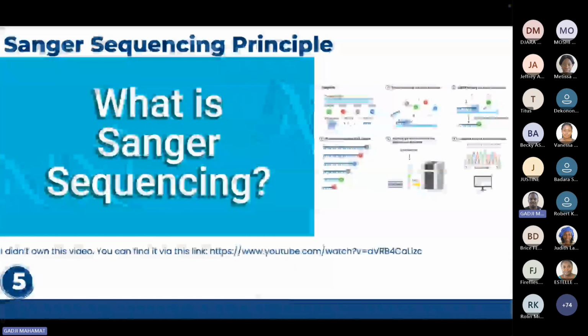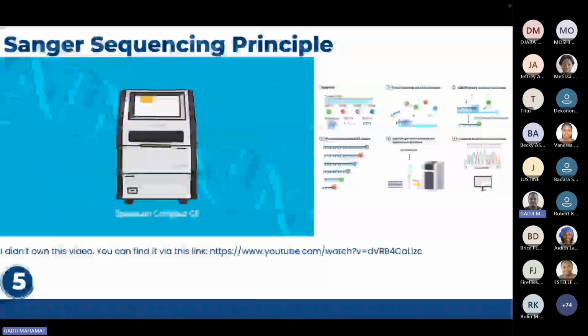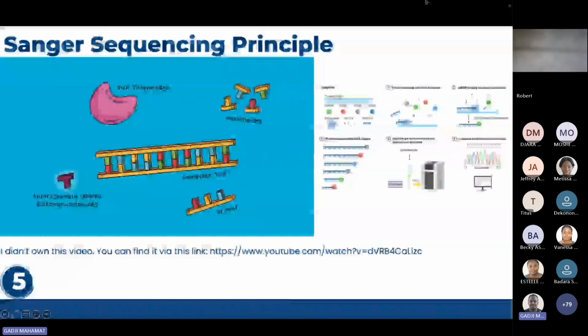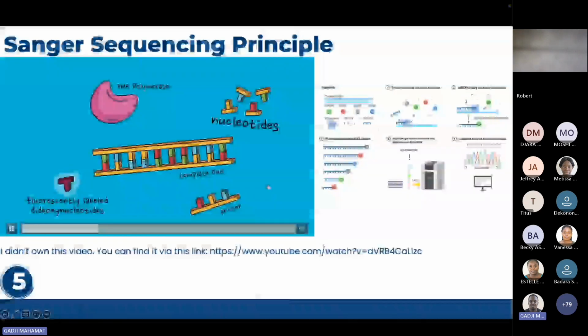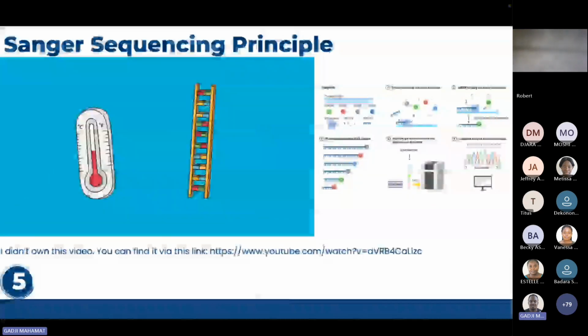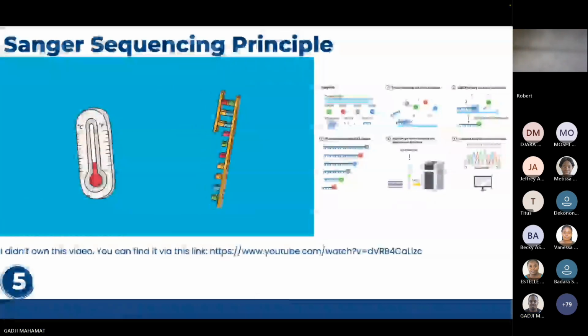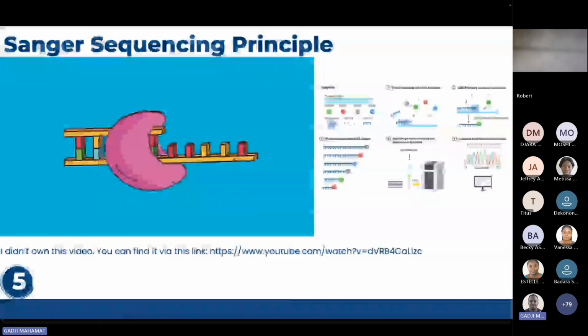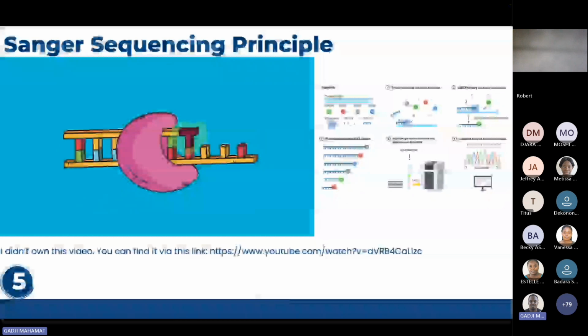of DNA sequencing since 1977. While new sequencing technologies have emerged since, Sanger is still an invaluable tool for all kinds of labs. The basic steps of Sanger sequencing are simple. The reaction involves template DNA, primer, DNA polymerase, nucleotides, and fluorescently labeled dideoxynucleotides. First, the DNA is denatured and then cooled to allow the primer to bind. The DNA polymerase enzyme then lengthens the strand according to the DNA template until it randomly places a dideoxynucleotide.